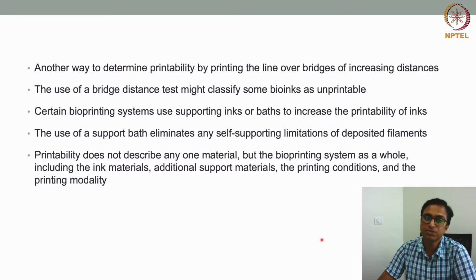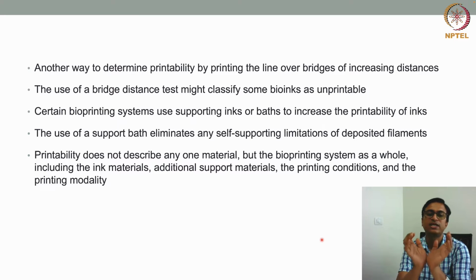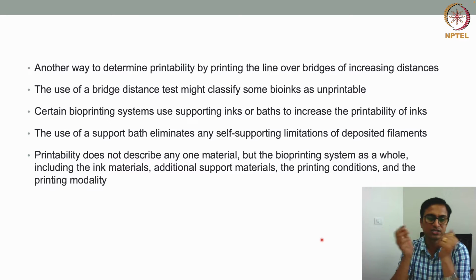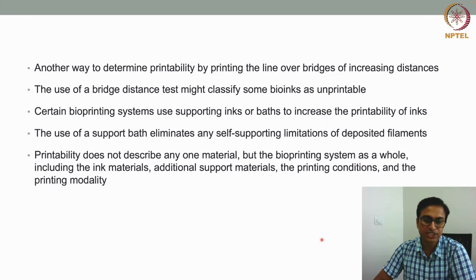So the use of a support bath eliminates any self-supporting limitations of deposited filaments. That means the support bath can provide support to hold the printed line or structure during the deposition, and it facilitates self-retention.